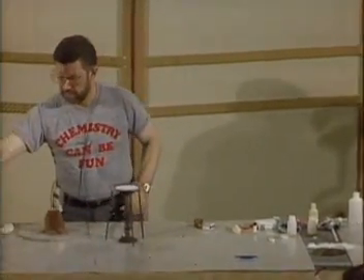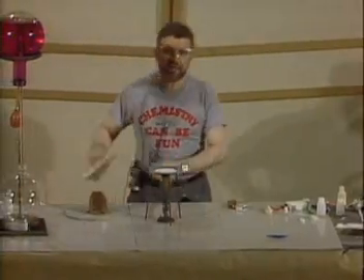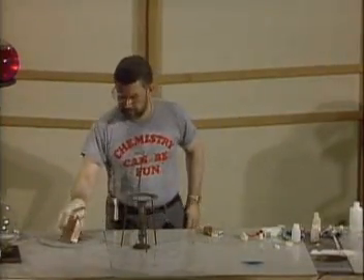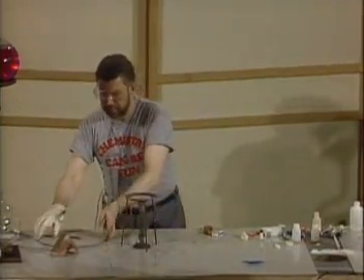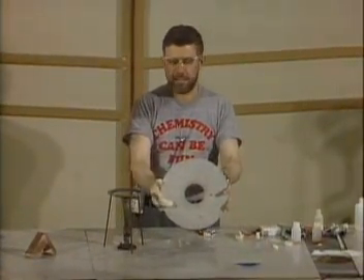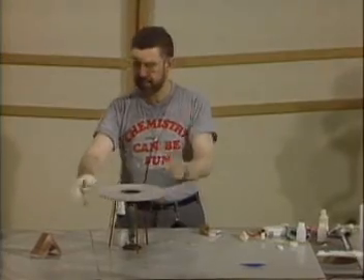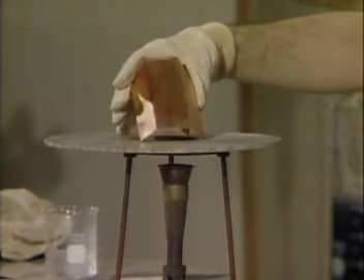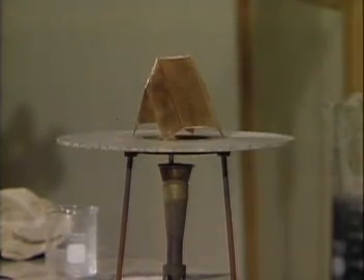I want to be sure that you understand all the experiments that we do are dangerous unless we really know what's going on. In this experiment, I'm going to take a piece of transite with a hole in it, and I'm going to put it on top of this tripod, and then I'm going to take a piece of copper — you see it's shining — and what I'm going to do is heat this copper by turning on the burner.